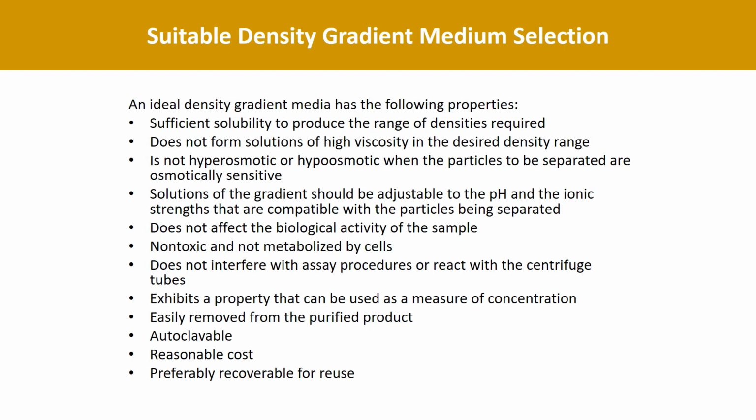And it should not affect the biological activity of the sample. Suppose you separate mitochondria, you separate a particular enzyme, and if the activity is gone, then your experiment is gone. So therefore, it should not have any effect on the biological activity of the sample.